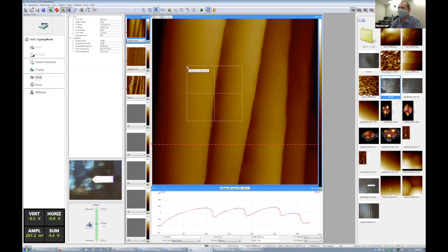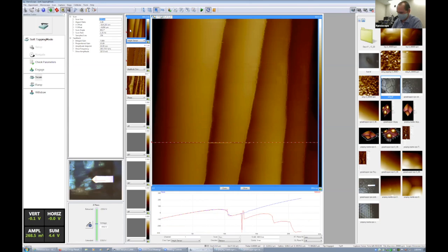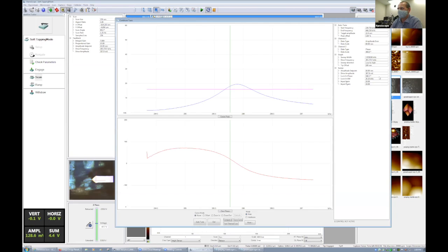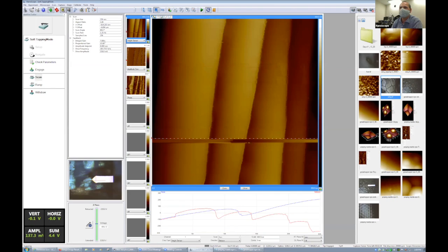They came all the way. It's like a one-room schoolhouse kind of thing. They live in a very rural area, and they were collecting all these bugs. And they mailed me a sample. It looked like a nightmare. There were crazy giant bugs, crazy small bugs. So we put them into this AFM and one of the SEMs that we had, and it was really cool to see, but also slightly terrifying.